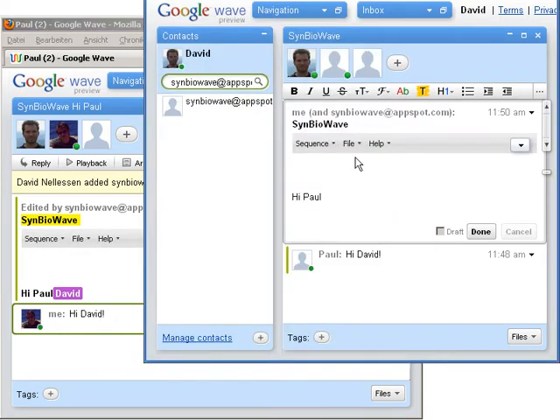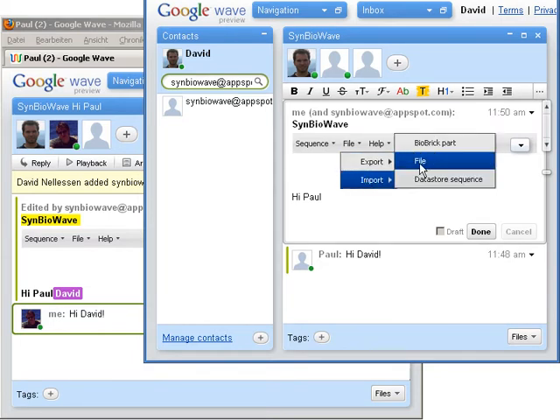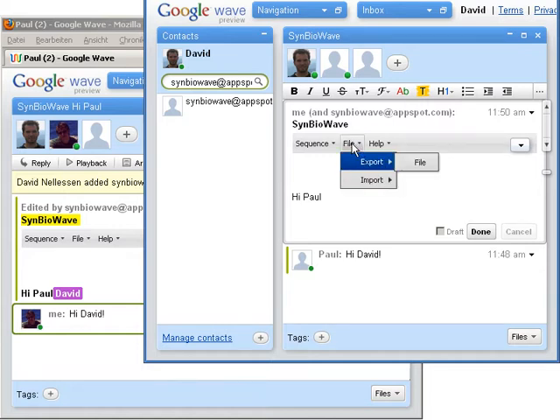This toolbar adds basic functionality like an import and export of sequences. The import is possible from file data, from biobrick parts, and from data store. And in addition, there are some really basic functions for the sequence, like a circular view. There's not more right now. Maybe there will be some more basic features in the future, but that's it for now.